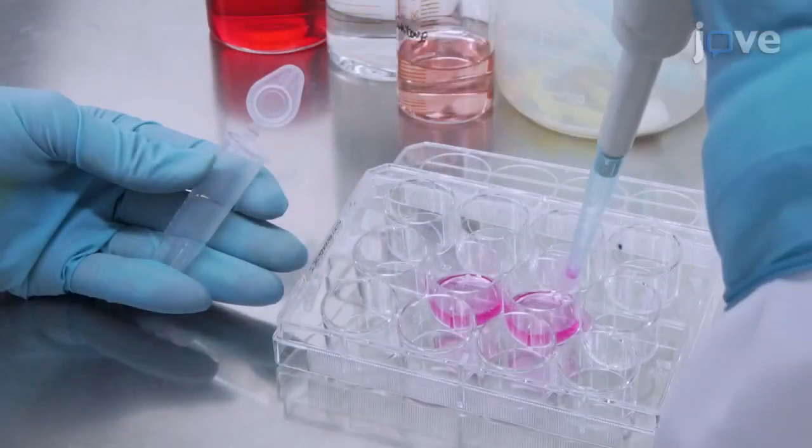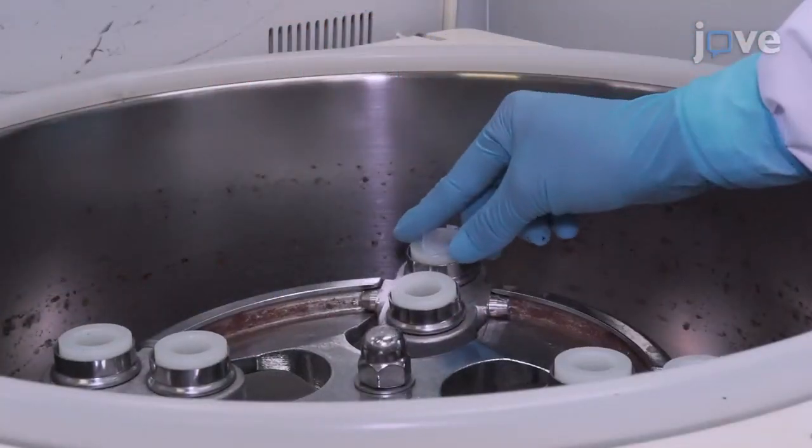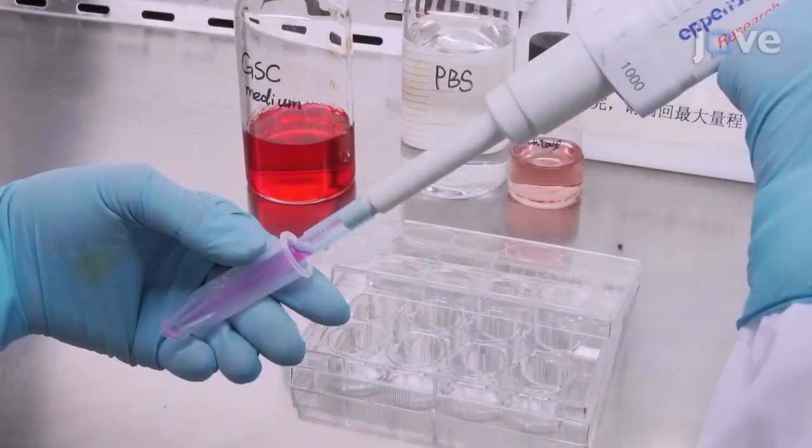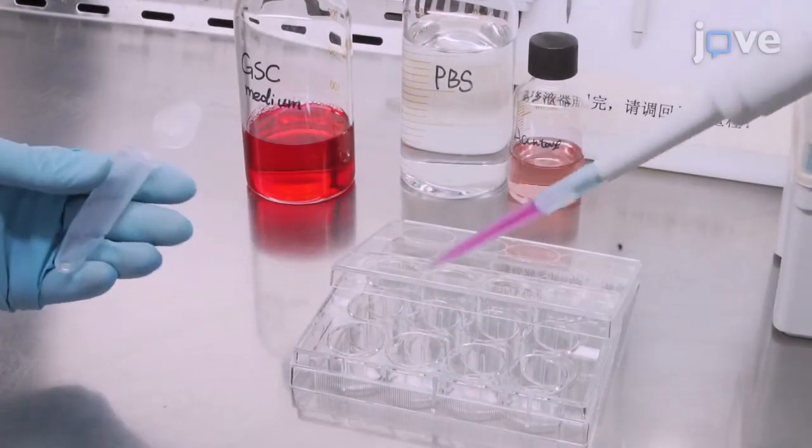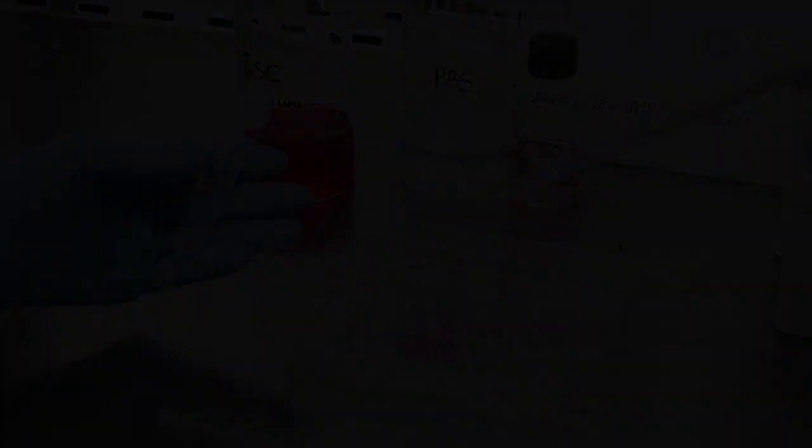On the following day, replace the medium in the wells by collecting the GSCs, centrifuging them, removing the supernatant, re-suspending them in fresh medium, and re-plating them. Culture the cells for another 48 hours.